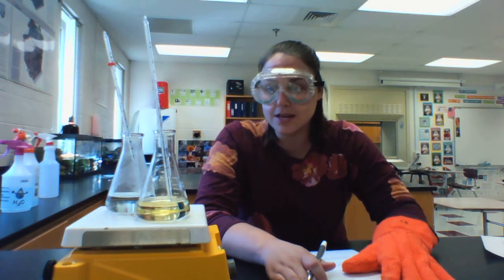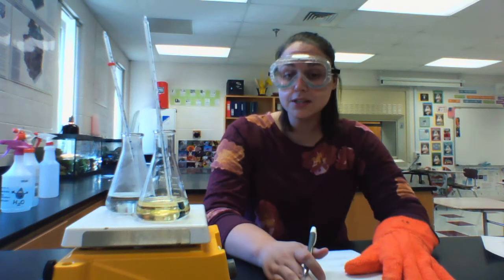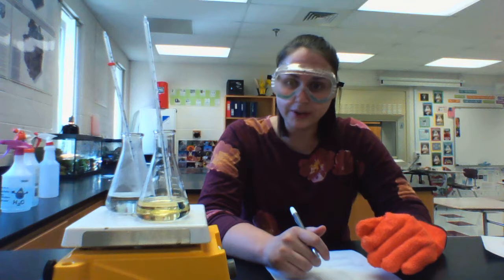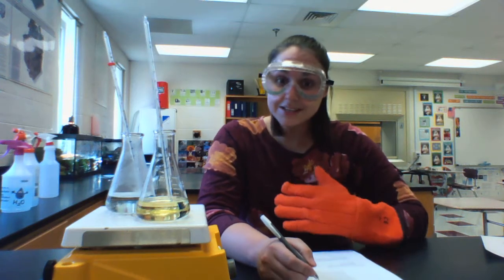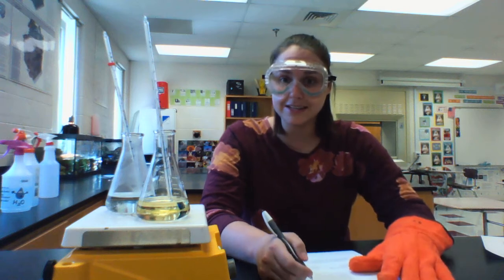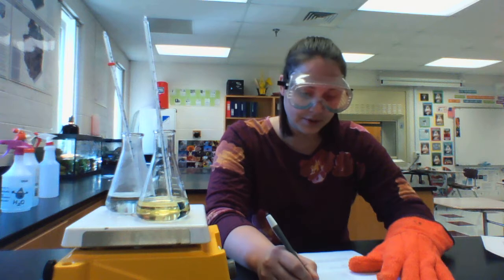Something else to think about while we're waiting for the next minute to arrive in about 25 seconds is, why did we use Erlenmeyer flasks and not just beakers? Well, since we're working with heat, we wouldn't want those substances to begin boiling and splatter on my face and hurt me. The way Erlenmeyer flasks are shaped will keep that liquid contained even if it did start boiling. We've got 5 seconds.